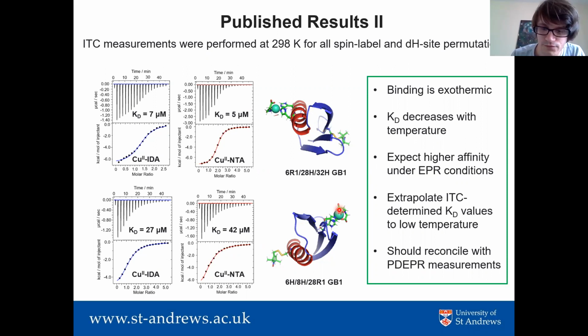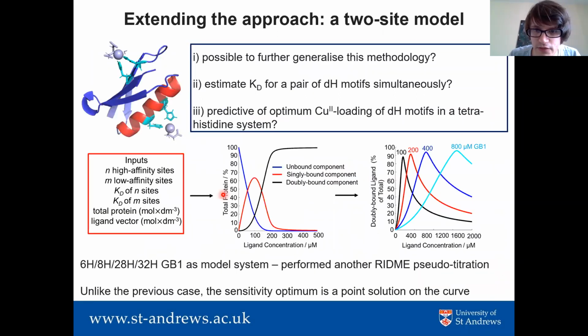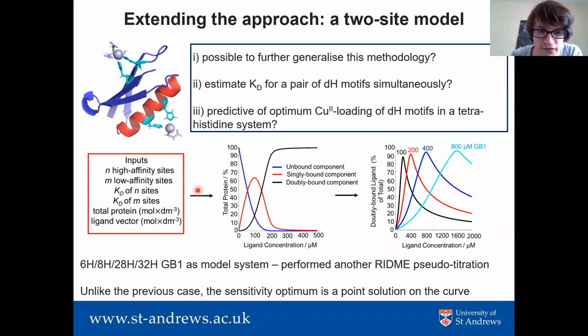If you were talking about using this kind of approach here, you can speculate that you have some non-specific binding, as you say, but really, we did this for the previous copper-nitroxide RIDME pseudotitration series, where we detected copper-copper RIDME.